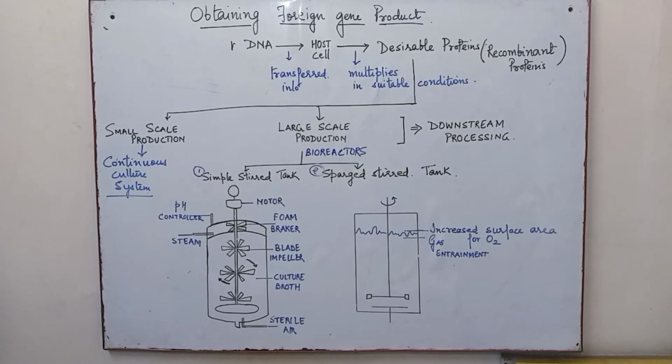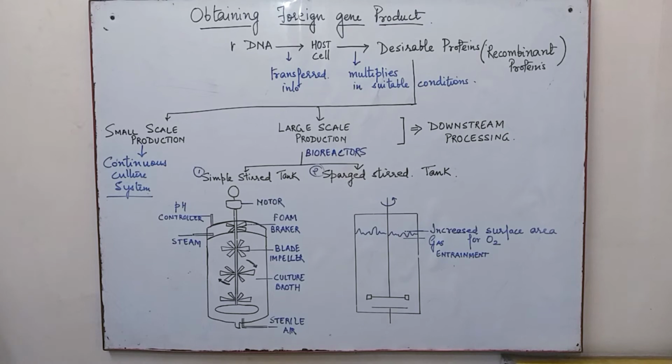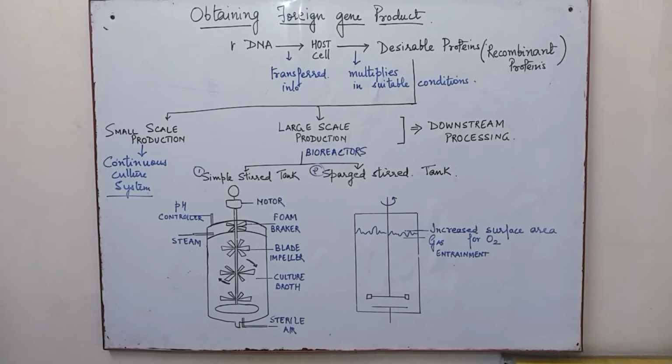So our optimum temperature is there in the bioreactors. It is continuously being maintained. The oxygen is an important component over here. So the oxygen substrate concentration is also maintained, because substrate has to be there, otherwise no proper reaction will be taking place.